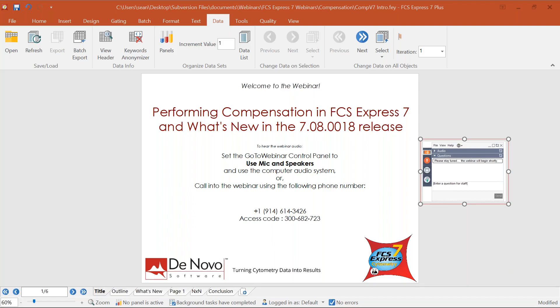Welcome to the webinar for performing compensation in FCS Express 7 and also what's new in the latest release of FCS Express 7, which came out in July 2021. The release number is 7.08.0018 and we're going to be covering some of the new functionality and user interface designs with that new release.